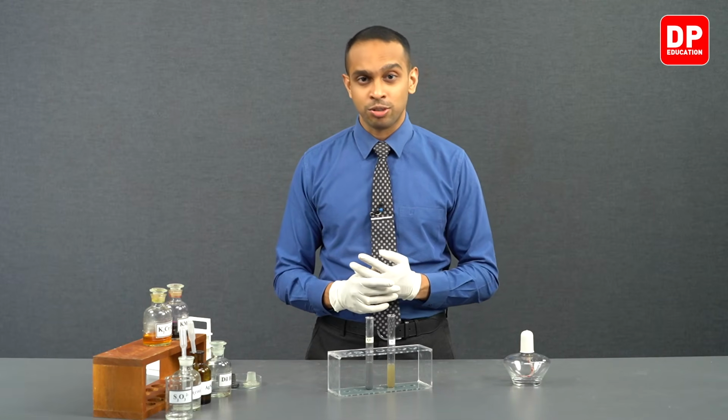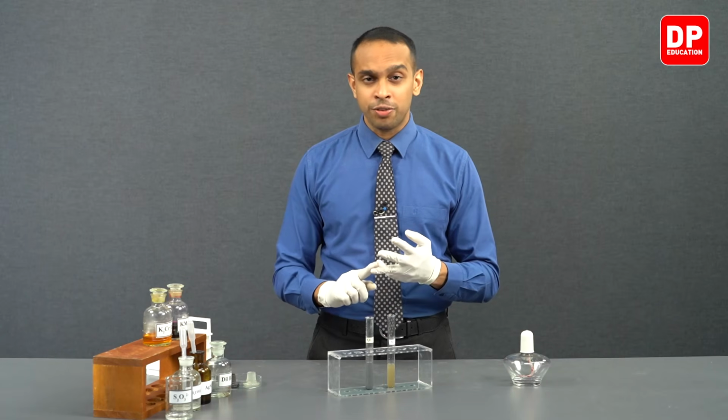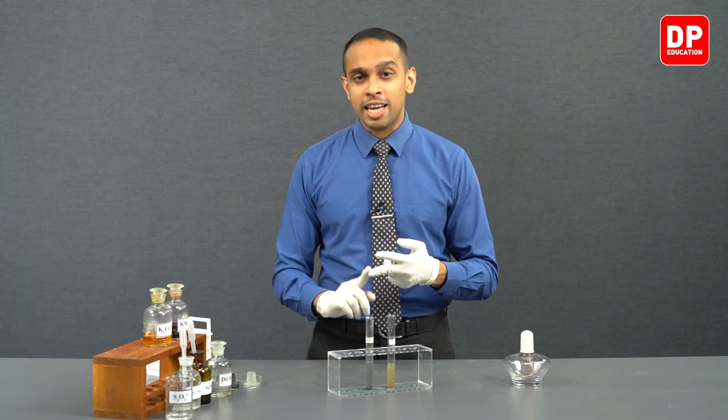To test for the sulfur dioxide that is produced, we sent the gas that is produced through acidified potassium dichromate and acidified potassium permanganate. Acidified potassium dichromate changes color from orange to green, indicating that there was a reduction of the dichromate ion to chromium 3 plus. While this reduction was taking place, sulfur dioxide got oxidized to sulfate ions.